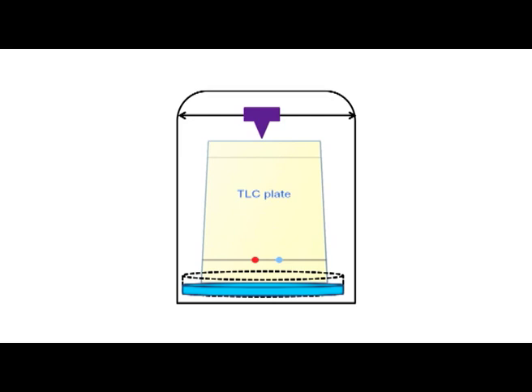If you look at the working of thin layer chromatography, as we know, the stationary phase is slightly different from paper chromatography. Here, a slurry of the adsorbent in a suitable liquid chosen as the stationary phase is spread over a flat and uniform plate. The chromoplate thus prepared is spotted near its edge with the solution containing the sample mixture.